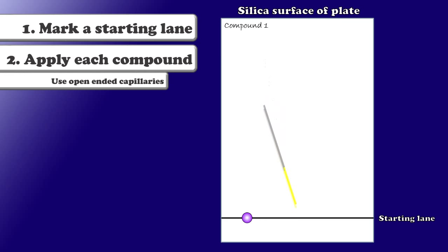I'll spot my other compound here in the middle of the plate. And just for demonstration purposes, I'm going to perform what's known as a spike, which is I'm going to spot a mixture of both solutions on the plate as well.